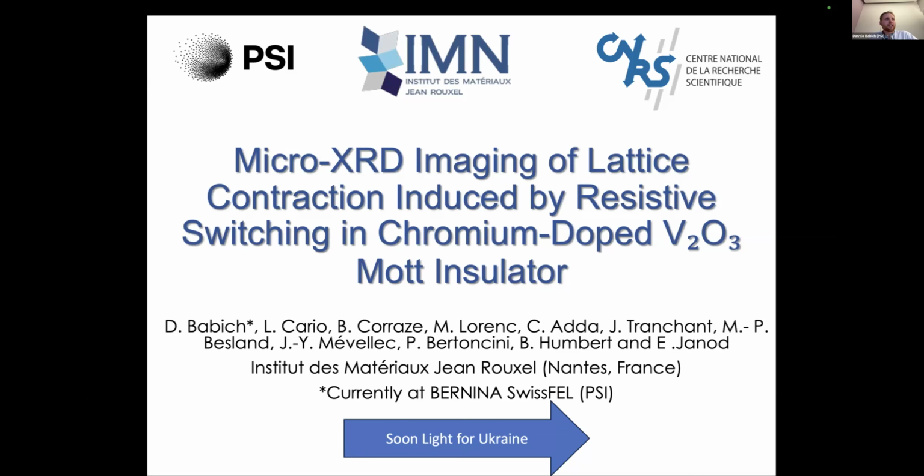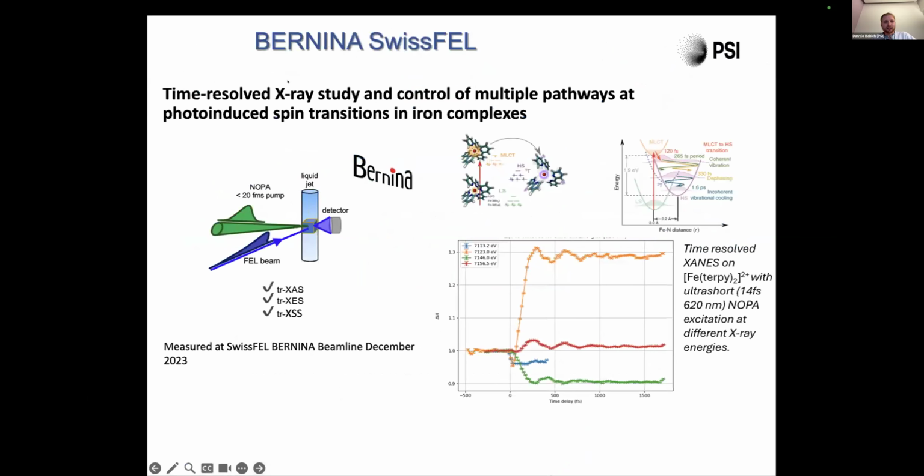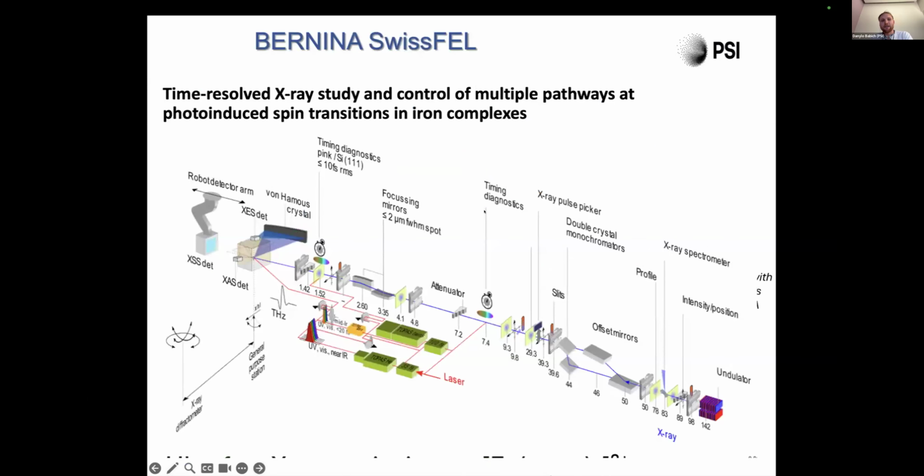At SwissFEL, all of you have probably heard the wonderful talk of Mykola Bernal, where they performed nice time-resolved X-ray absorption spectroscopy and X-ray emission spectroscopy. At Bernina, we recently succeeded in achieving much higher time resolution, around 15 femtoseconds RMS.